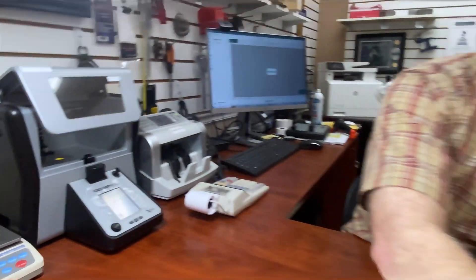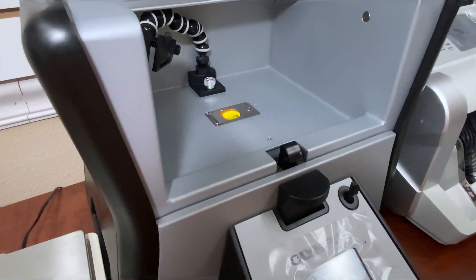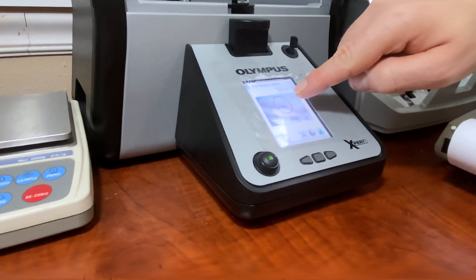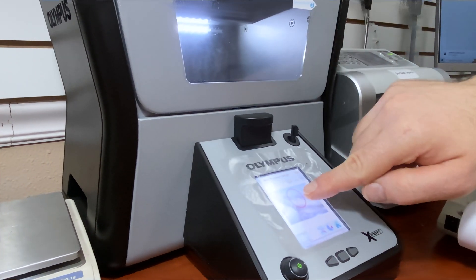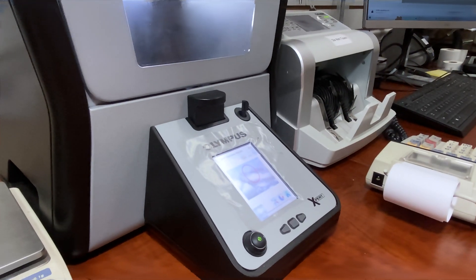One of the ways we use to test the teeth to see if they're gold is this X-ray machine. I'm going to do a demonstration. Inside there's a little sensor — this is a great piece of equipment. We put the piece on top of the sensor; there's a little camera in there and you can see it's detecting the gold. The red circle shows where it's going to take the X-ray. It does 10 X-rays in a short period of time and comes back with the carat.